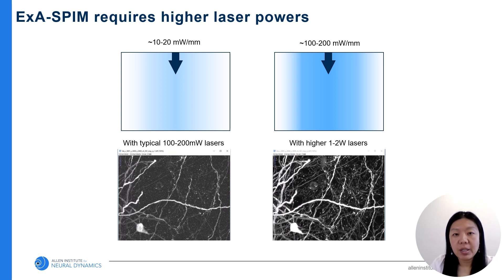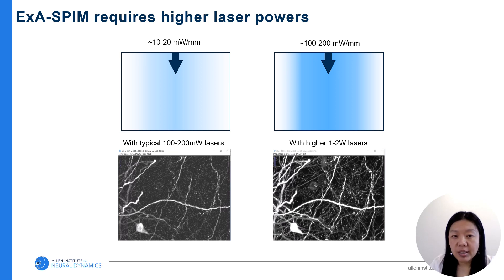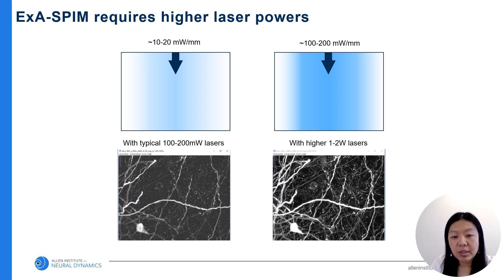One challenge for ExaSPIM is laser power. Since the field of view is larger, the same amount of light that used to be spread along a narrow sheet now has to cover about 5 times wider sheet, which is insufficient for good SNR. Here is an example: the same region imaged using the ExaSPIM system — the left image used a typical 100 to 200 mW laser, while the right used a 10 times higher power laser. Clearly, the right image has better SNR and offers more detailed information.